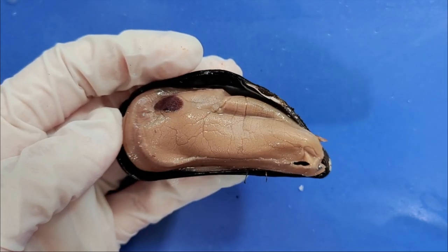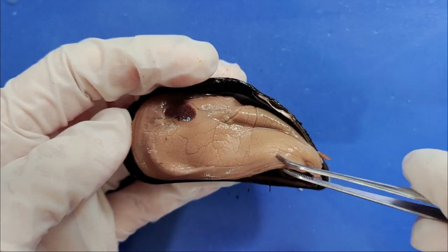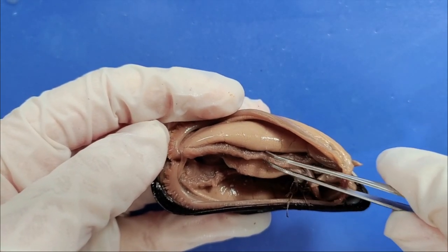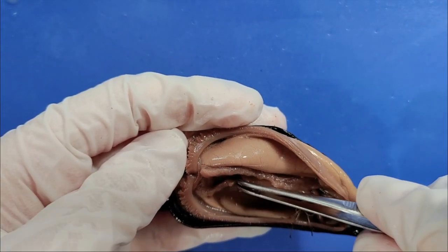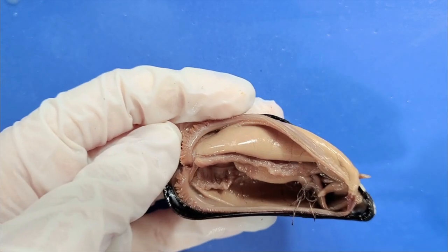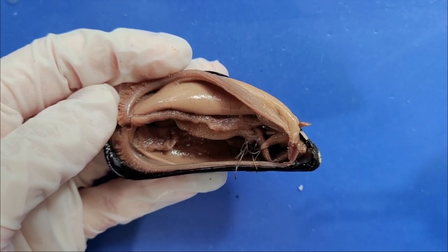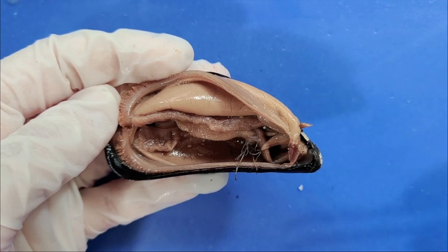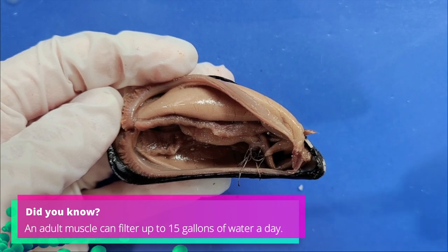Change of plans — I actually have a different mussel here because the previous one wasn't as well preserved. Now when I lift the mantle, you can see this feathery flap, which is the gills. There's one on either side, so you can see another one here in the back. Gills serve the two important functions of breathing and eating, by removing oxygen and food particles from the water. Mussels are filter feeders, which means that they eat algae, and other particles filtered from the water by these gills.